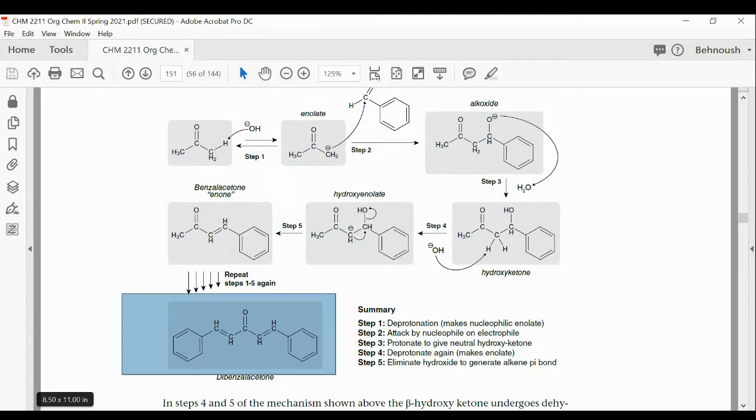So the broad peak refers to hydrogen bonding, and the energy is spent there, spends too much time, and that broadens the peak. But for the other one, we're talking about a strong peak. The CO double bond, because it's polar, would give a strong peak. So it shouldn't be a wide or broad peak. It should be a strong peak.